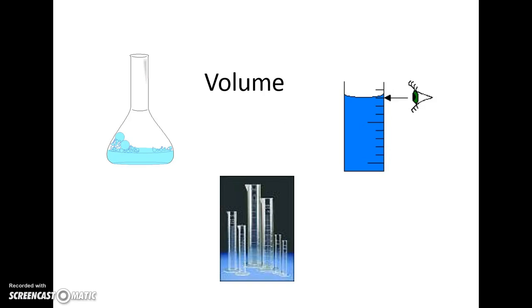Hello, welcome to today's lesson on volume. Today I will be teaching you how to use a graduated cylinder and how to do readings properly.